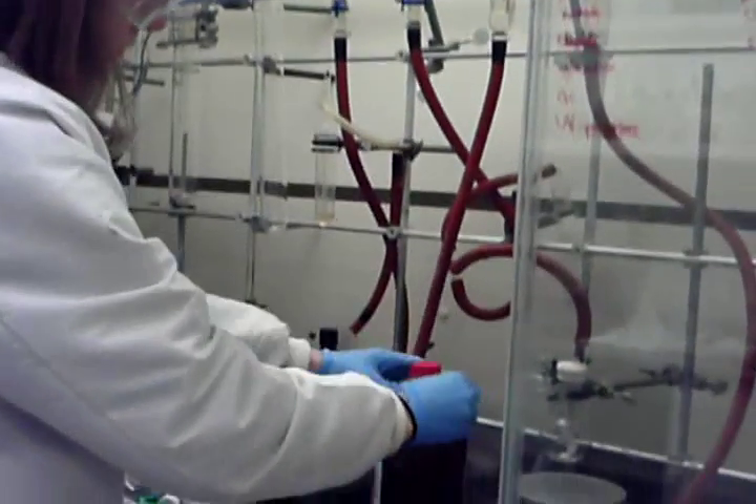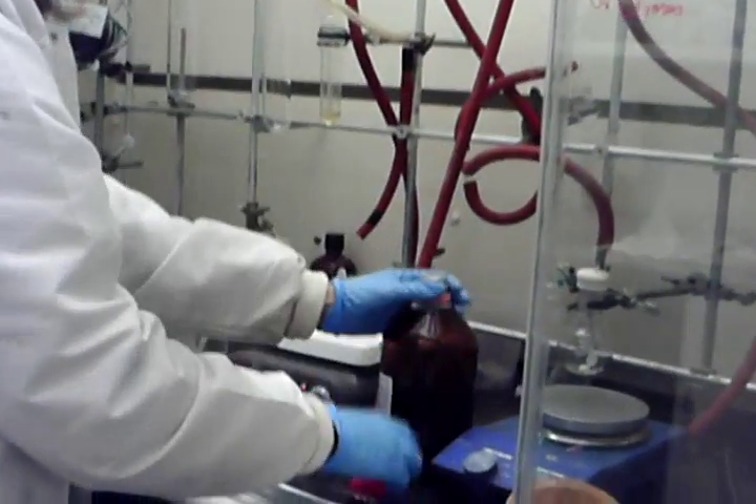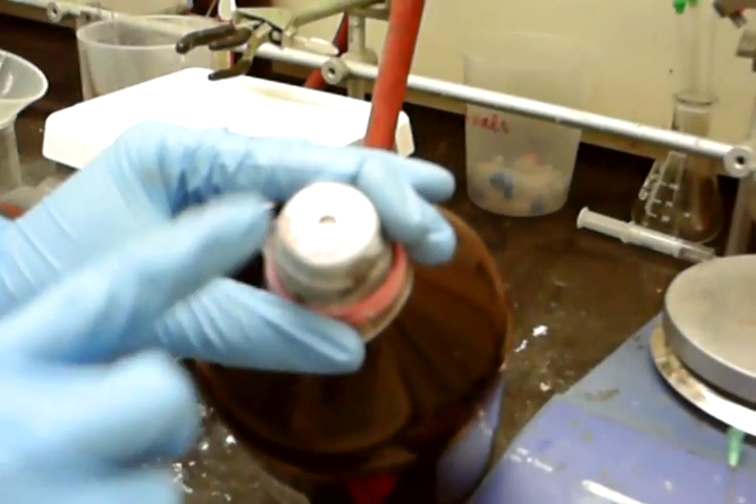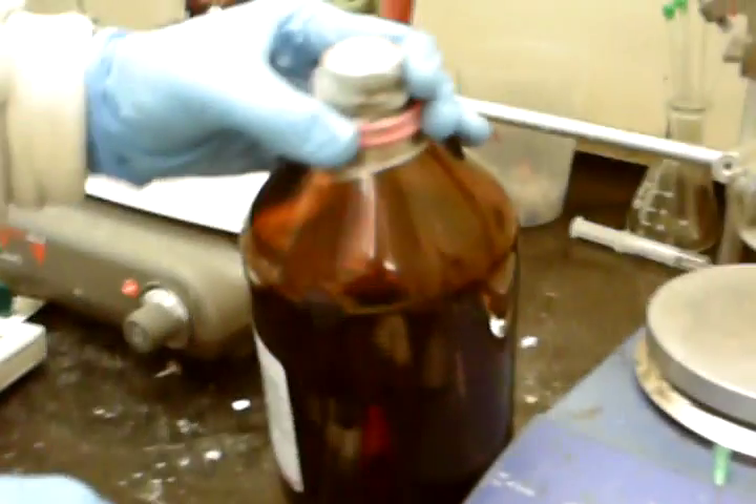When I open the Sure-Seal bottle, you'll see it's already been used before. You should never have more than two holes in a Sure-Seal bottle — one is your inlet and one is your outlet.